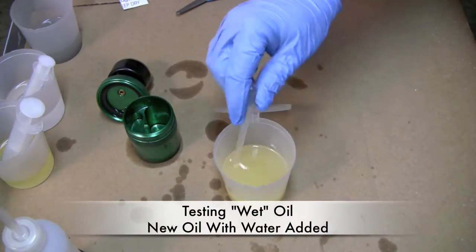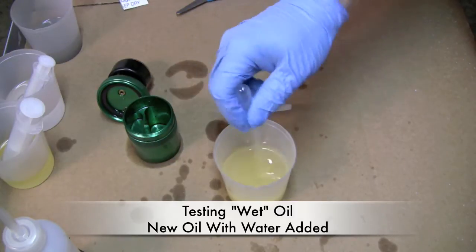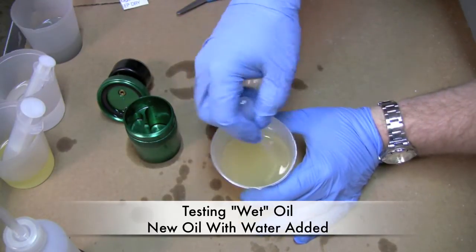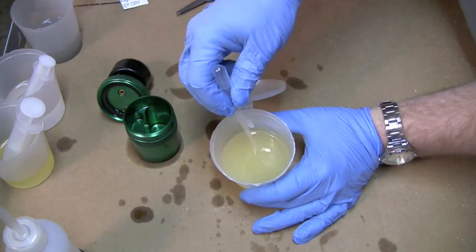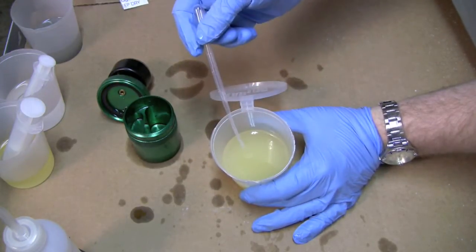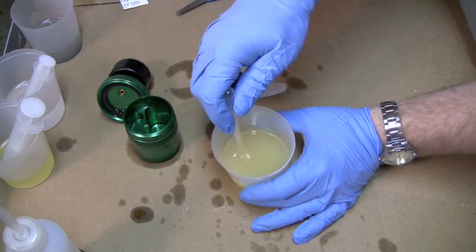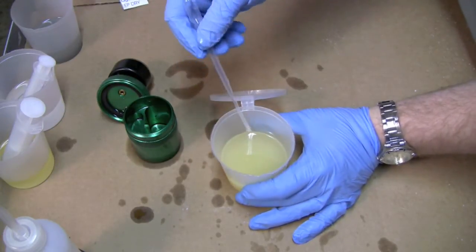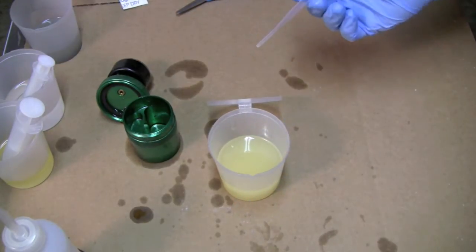The next sample I took was some new oil that I mixed with water. I didn't measure how much, so I don't know the exact content, but you can see that this oil is cloudy. If you pull oil out of a restaurant bin and bring it home, cloudiness is one indication of water in your oil. It's not the only indicator — it could be lard or other things — but this creaminess typically can indicate the presence of water. This is the sample we'll use for the second test.